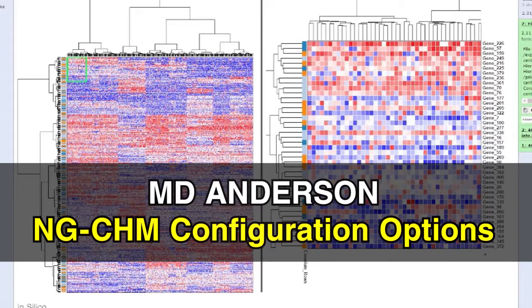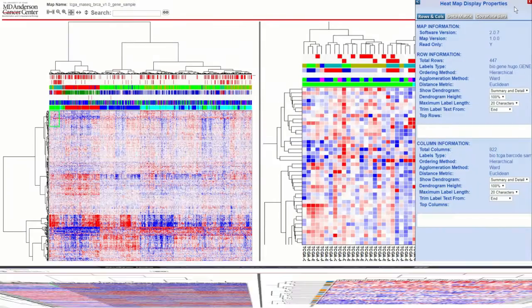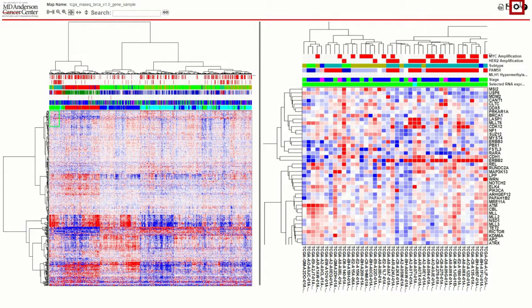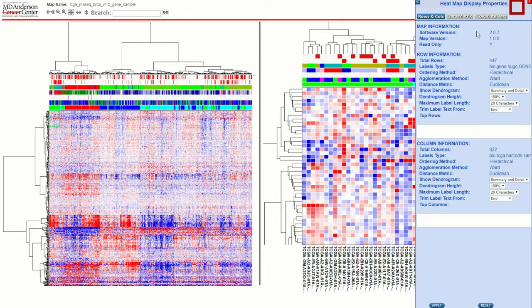In this video, we will be going over the configuration settings within the gear icon. At the top right of the screen, select the gear icon.